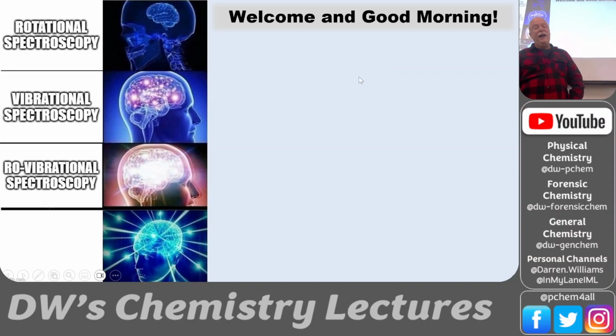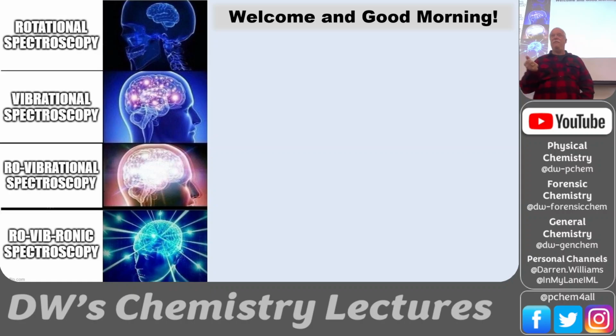And now we're doing rovibronic. Like, what in the heck is that? Well, this is the Iodine Lab. That's the last lab of the course. And then you have a revision exercise. But the Iodine Lab is what we're talking about today. And I'm going to walk you through the whole thing.